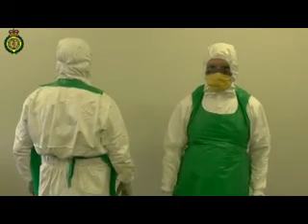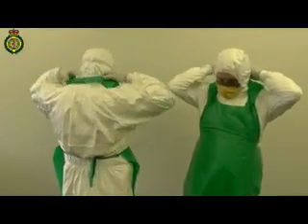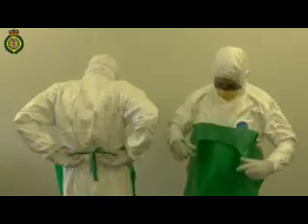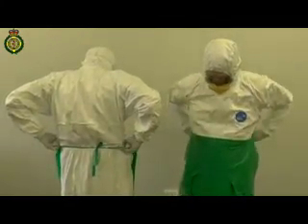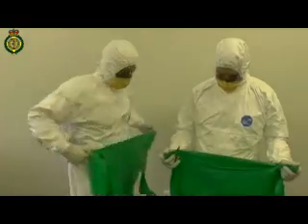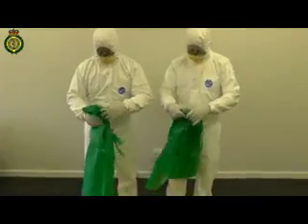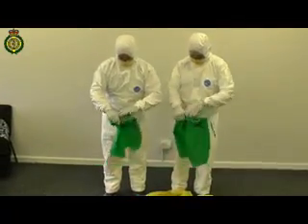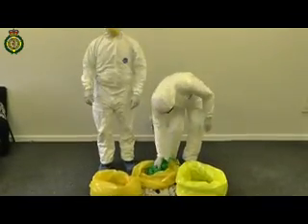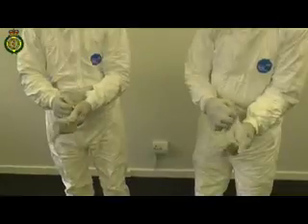Remove the apron. This process is the same for all levels of PPE where an apron is worn. Hold the neck strap close to the back of your neck. Break the strap and fold the top of the apron down. Break the back straps and fold the apron forwards in on itself. Roll up the apron, only touching the inner side, which is clean, and dispose in the middle clinical waste bag. Change the outer layer of gloves for a clean outer pair.